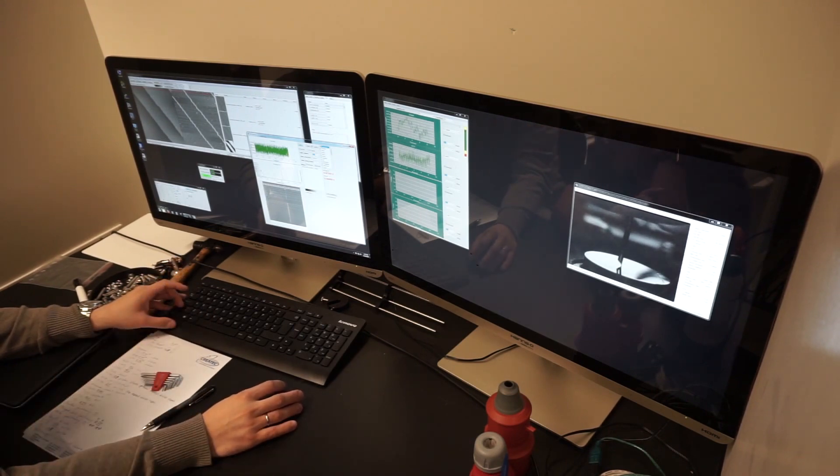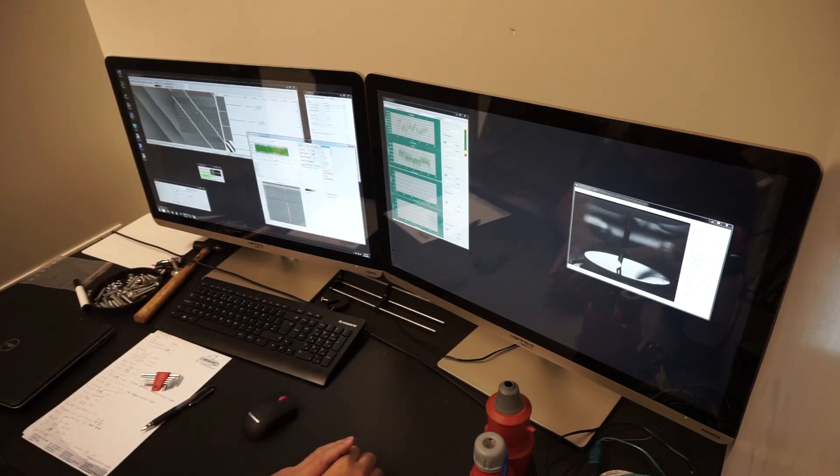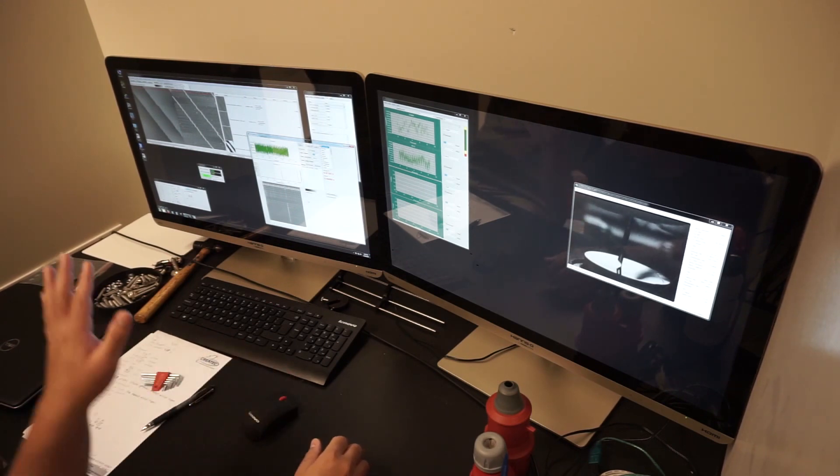It sounds 8, it's almost double action. It's the first time that I see section frequency. Maybe it's a tip so we can try just to stay at this field and try to shape a tip, or we can image then try that.